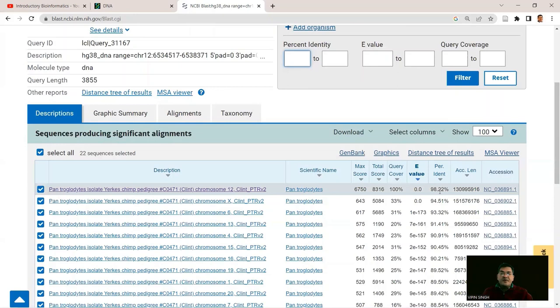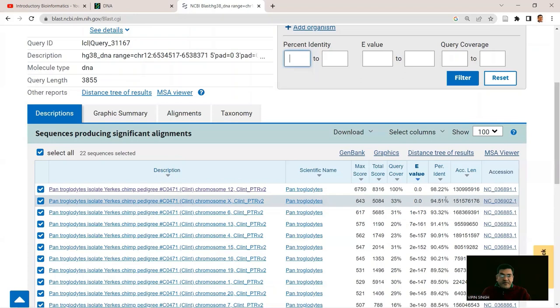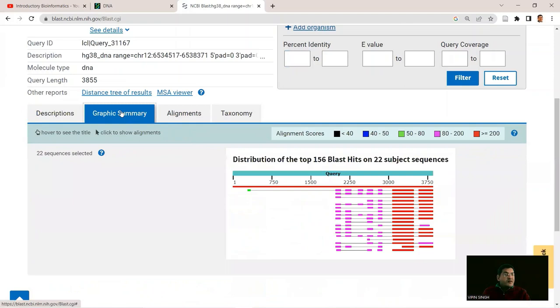The best match has a percentage identity of 98.22%, meaning more than 98% of nucleotides are identical between human and chimpanzee at this locus. The second match has 94.51% identity and E-value of 0.0, but only 33% query coverage — more than two-thirds of the sequence doesn't match, likely due to a low-complexity or repeat region. The Graphic Summary tab visualizes the same data, showing the complete first match and the partial subsequent matches.